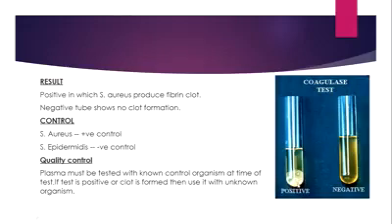This is coagulase positive. That means that the clot formation is positive, and of course the Staph aureus species are considered to be coagulase positive because they form coagulase, the clot formation. Now the negative one, in which there is no clot formation, is going to be the negative test. And the other 2 species of the staphylococci, the Staph epidermidis and Staph saprophyticus, are going to be coagulase negative.